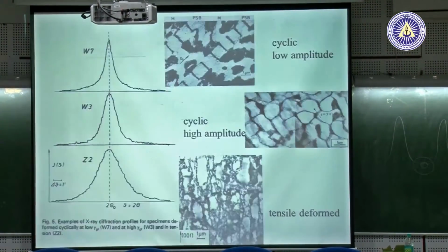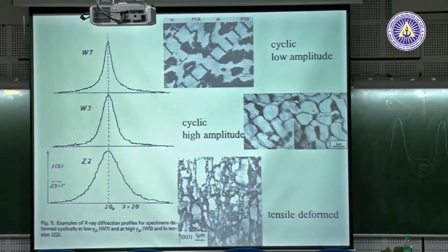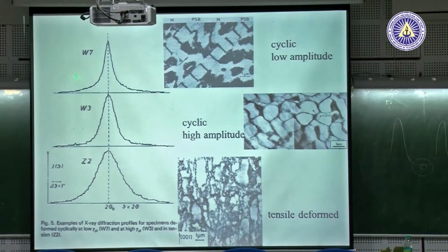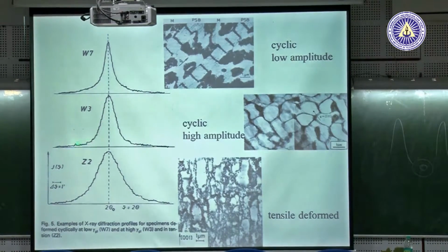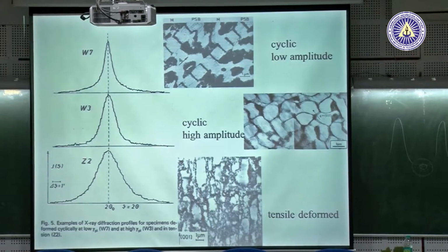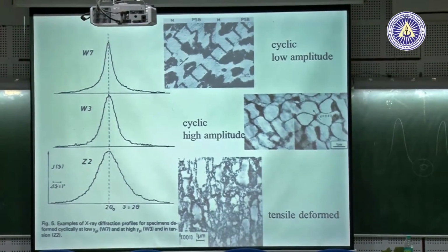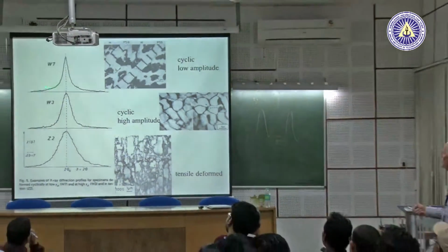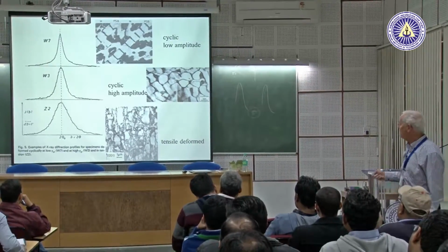Okay. Long and short tail is not really obvious from the figure. They look more or less the same. No, look. This tail is longer than this one. I can try to digitalize it and put them together. Can't you see that? Who can see it, that one is longer than the other one? The upper, here the tail is longer. It means it goes down at a slower rate than here.